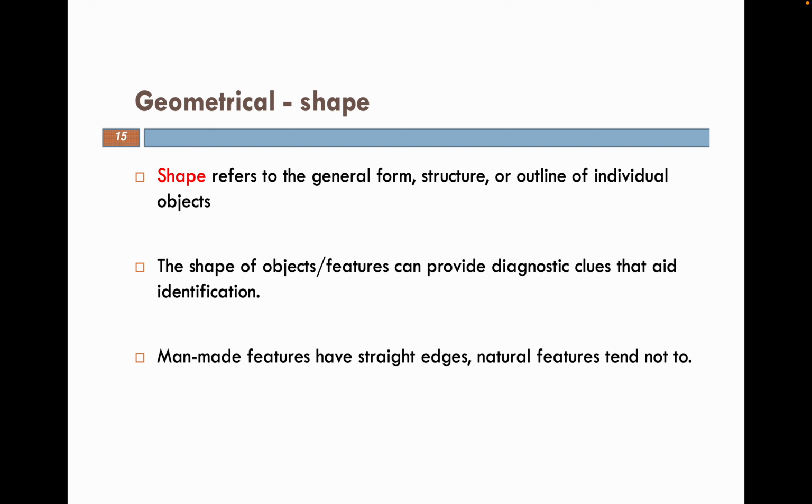For example, the difference between a platelet and an activated platelet is that the regular inactive platelet is just sort of round, like a kind of an oval, like a bread roll, and the activated platelet goes all spiky and really cool looking. They would have the same mass; that is still conserved. They're just changing the way that mass is distributed. And so you could image a little section of blood, a sample of blood rather, and look at the platelets and gauge, based on the shape, the amount of activation there, for example.